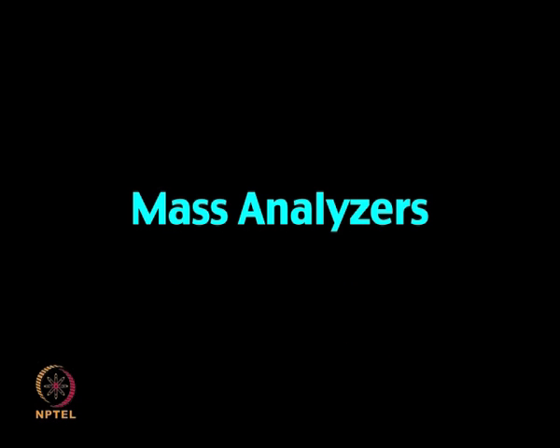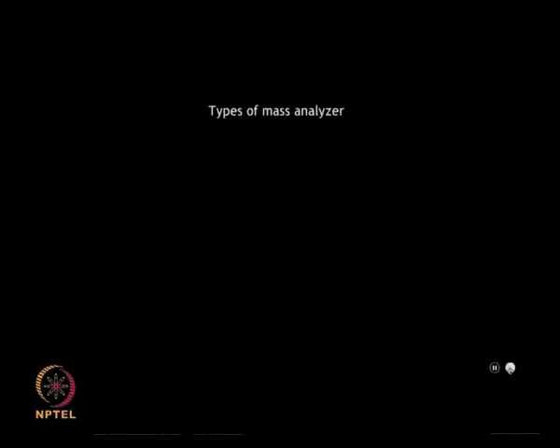It resolves the ions produced by the ionization source on the basis of their mass to charge ratio. Various characteristics such as resolving power, accuracy, mass range and speed determine the efficiency of these mass analyzers. Let us discuss a few most commonly used mass analyzers for proteomics applications.